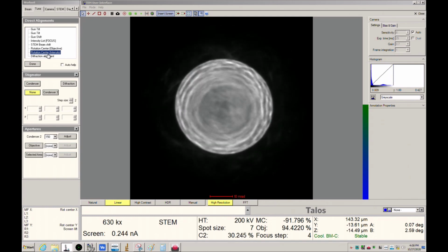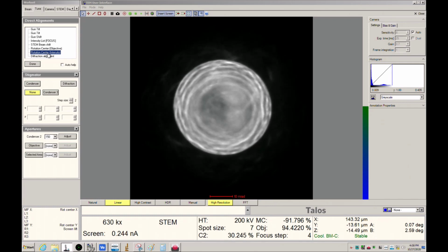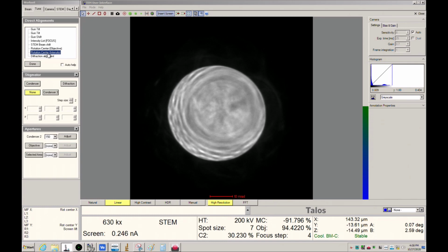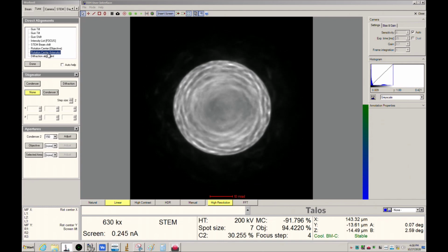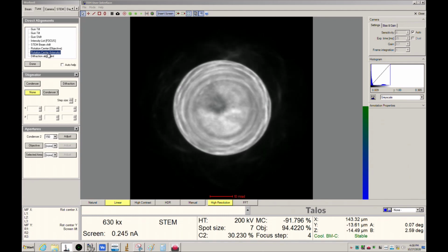So you're adjusting your multifunction knobs right now. And then periodically you're adjusting the focus to make sure that it's expanding and contracting concentrically. So you can see right there, it's definitely off. I did that deliberately. And that looks really good right there. And you can select done.